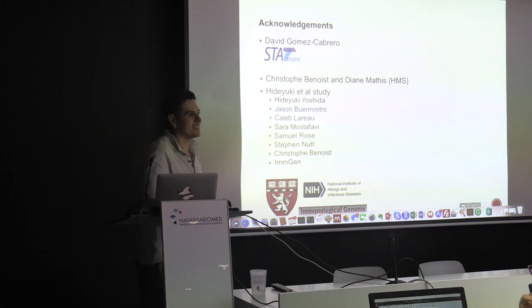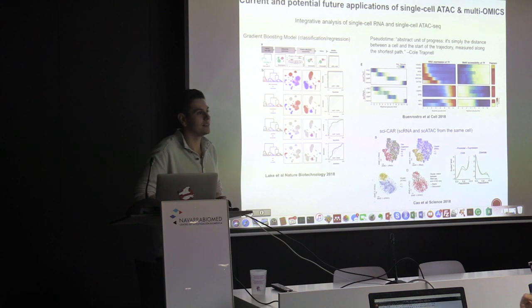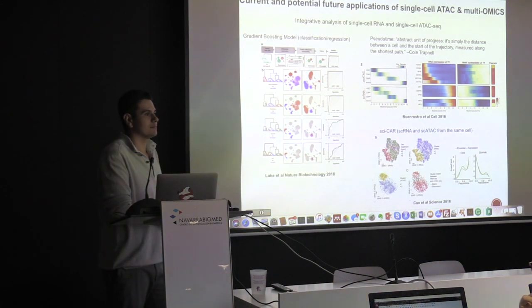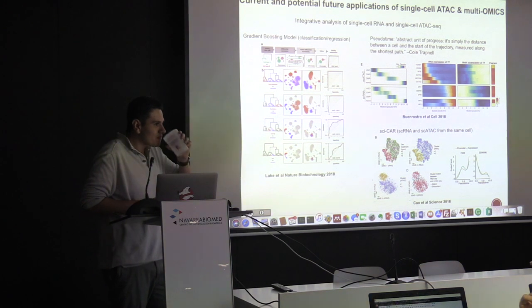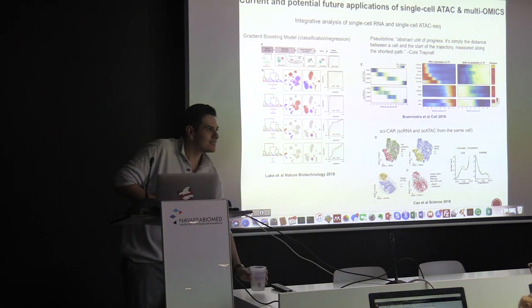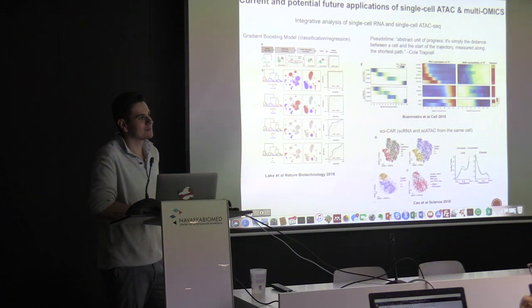At the single cell level, we can expect that we can have some stochasticity at the OCR level also, like yes, we have in gene expression. So maybe correlate those stochastic events.